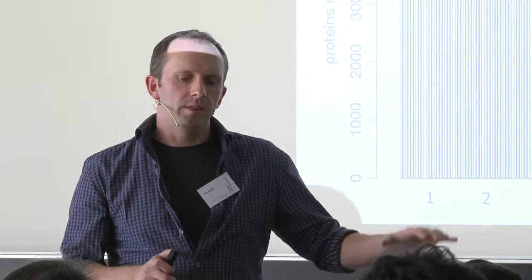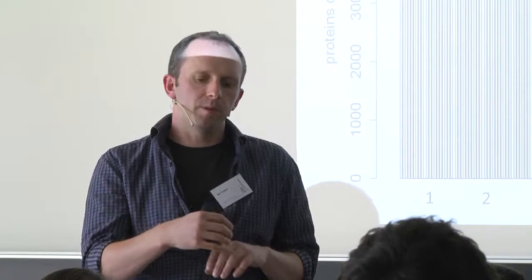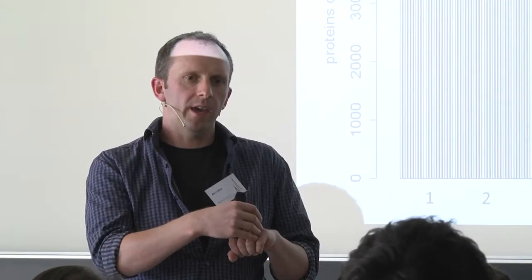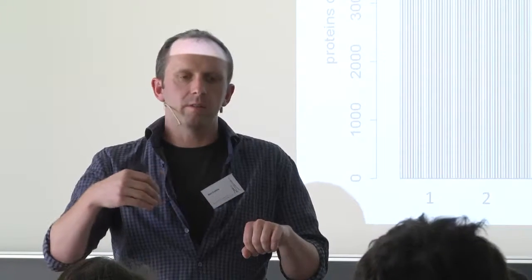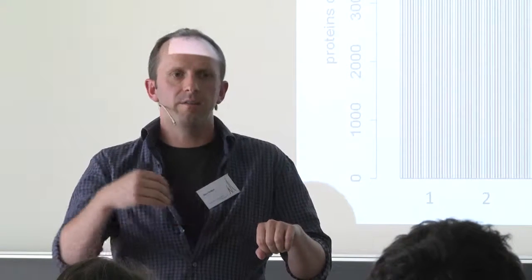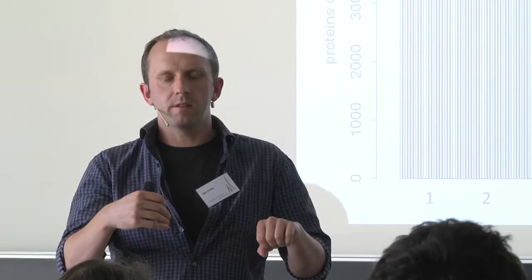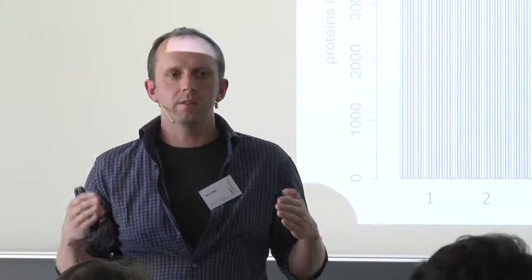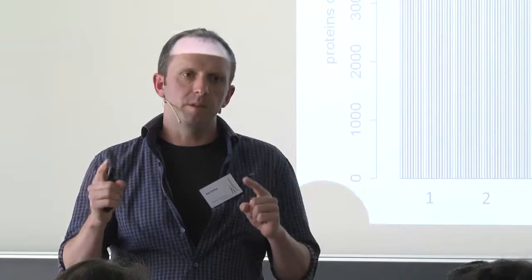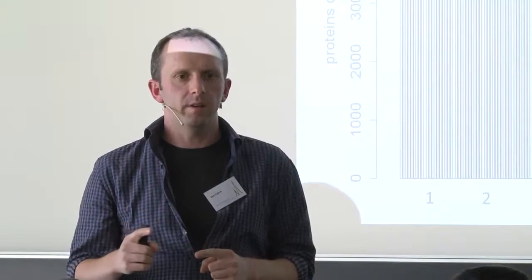You may need to be careful about certain things. If you have a peptide which is post-translationally modified at one amino acid, and there's also another possible isoform where it's modified at another amino acid residue in this peptide, then sometimes the signal in SWATH for these two peptides can look a lot like each other, and you need to be careful that your library spectrum doesn't cross-match from one to the other.